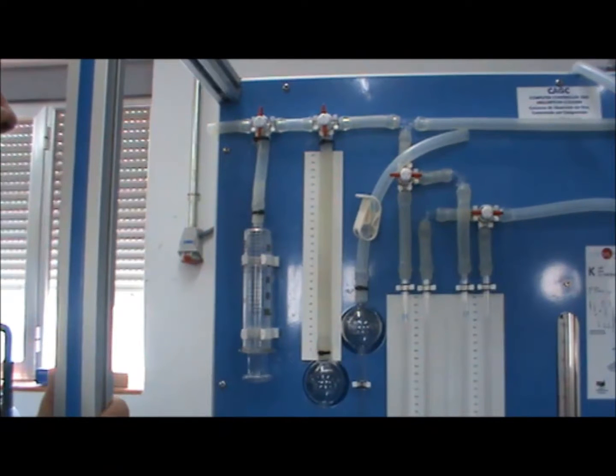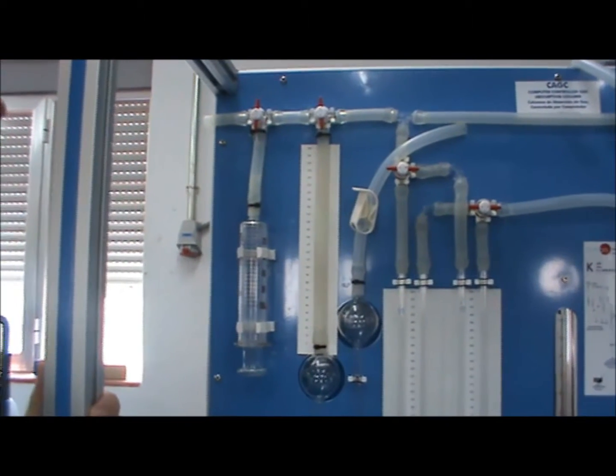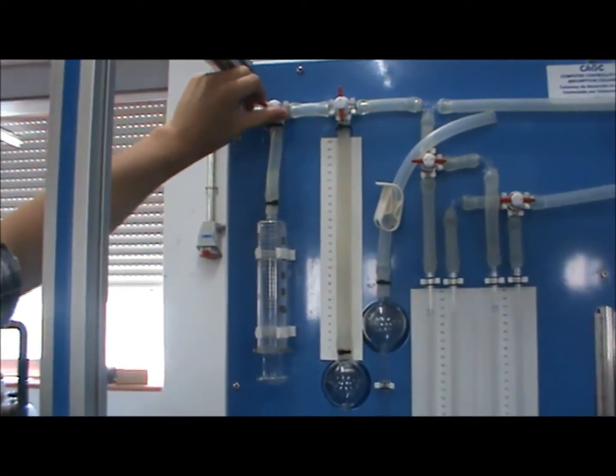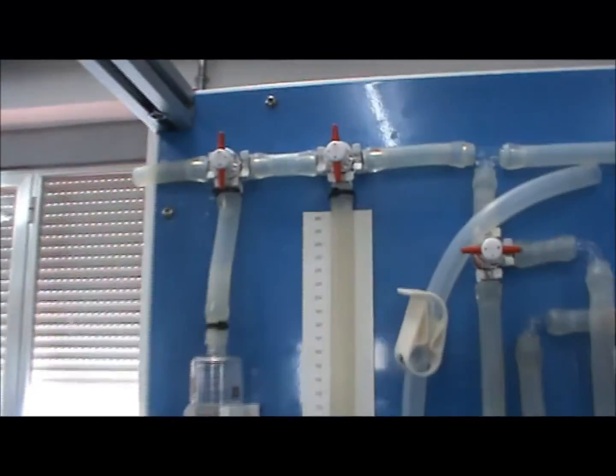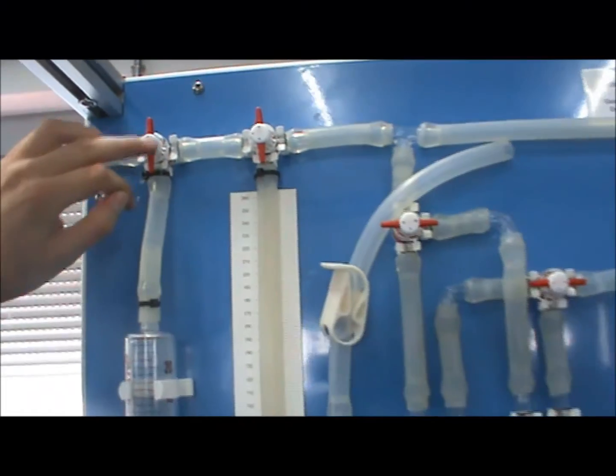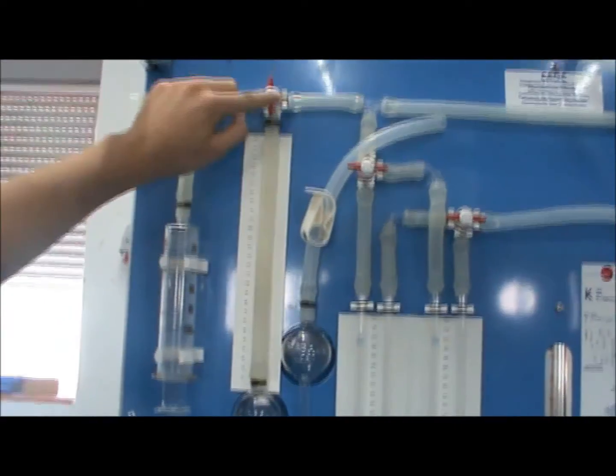Make sure the syringe is fully compressed by expelling the air to the atmosphere. Close valve VT3 to the atmosphere, which connects the syringe in this circuit, allowing it to charge the KOH solution to the vessels.